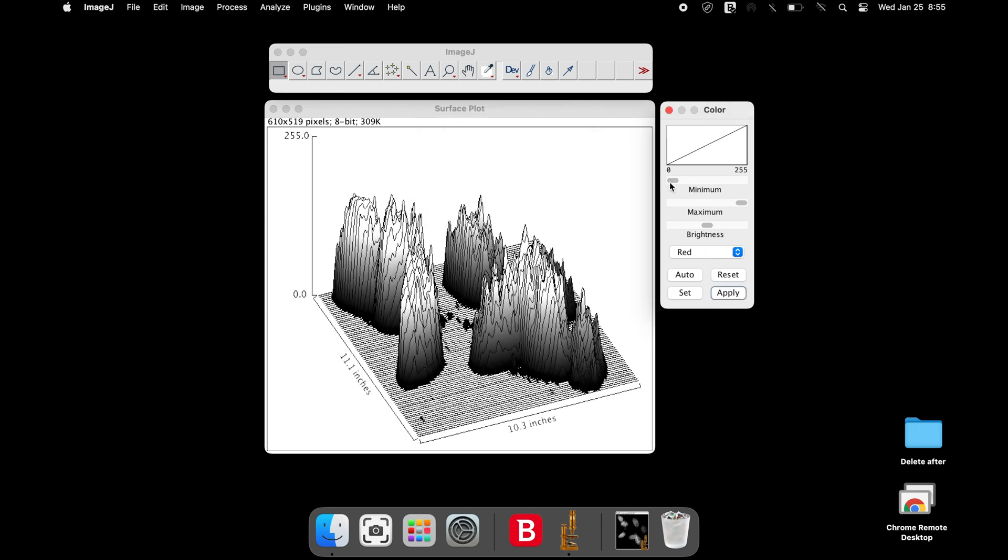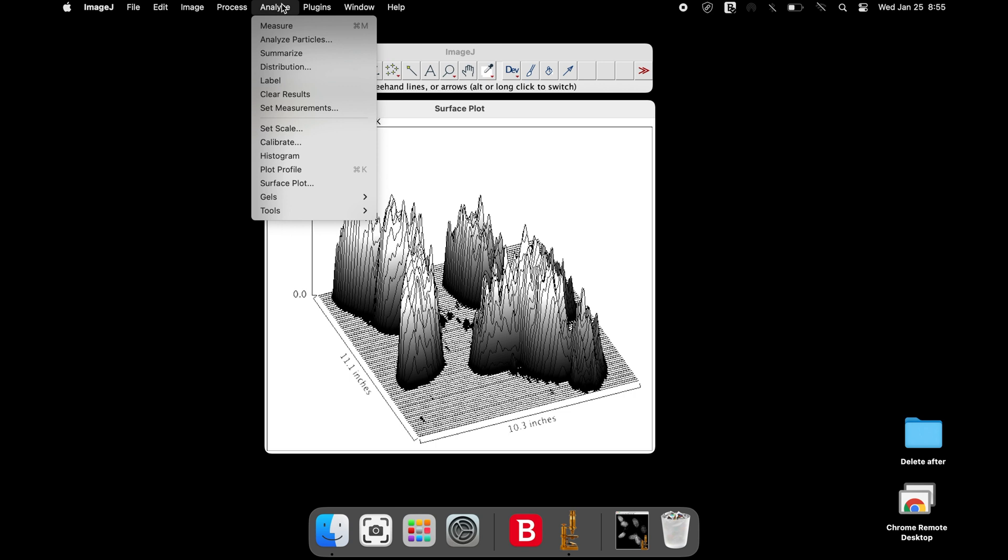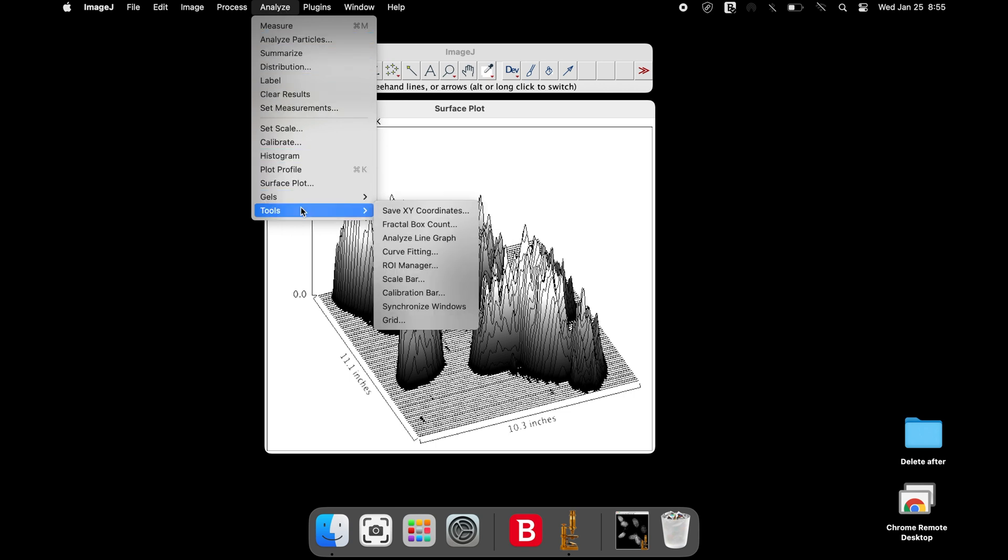To indicate the intensity level, a calibration bar can be applied. Click on Analyze, Tools and select Calibration Bar.